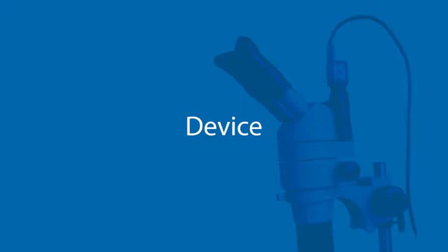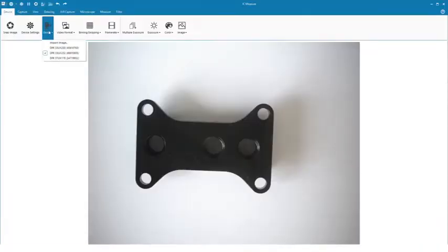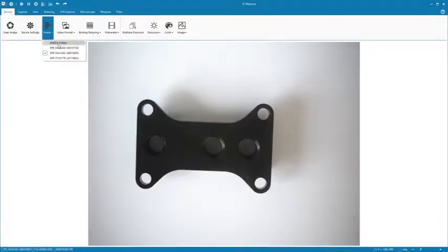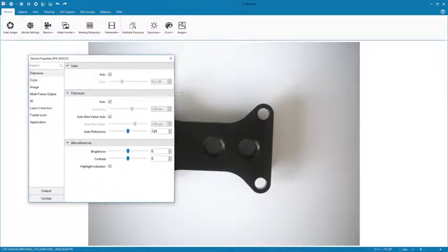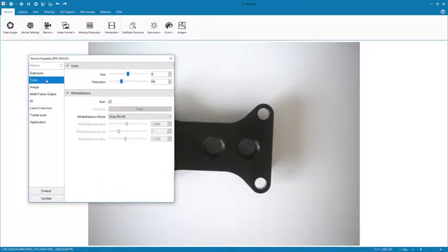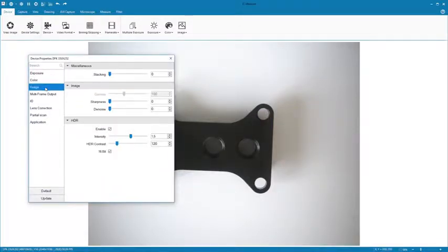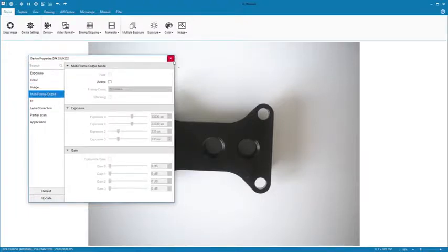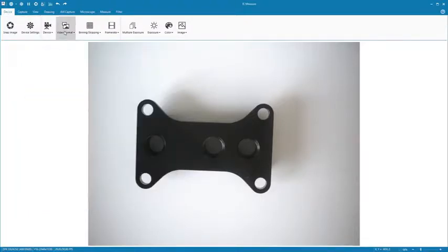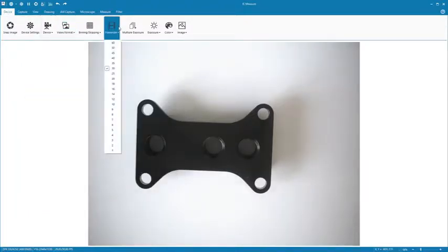Under Device, you can start by choosing a device and select the optimal camera parameters. Under Device Settings, you will find the specific settings possible for your chosen device. You can also select video format and frame rate.